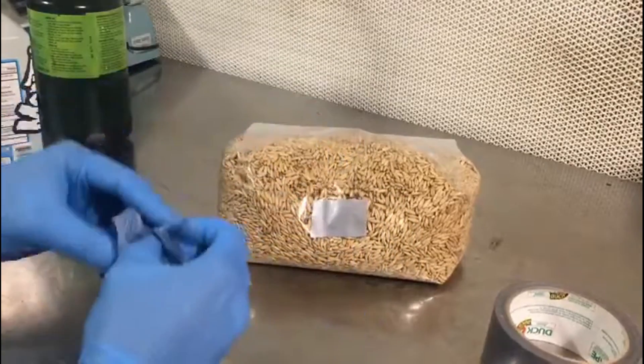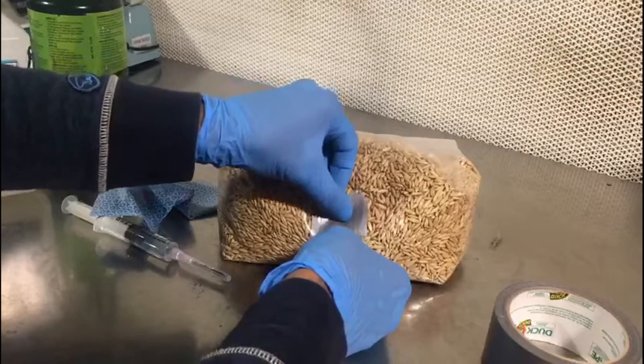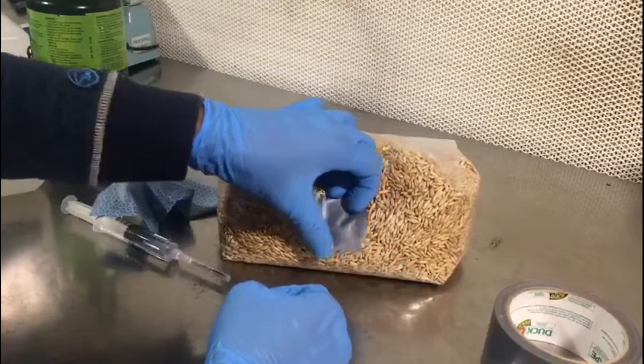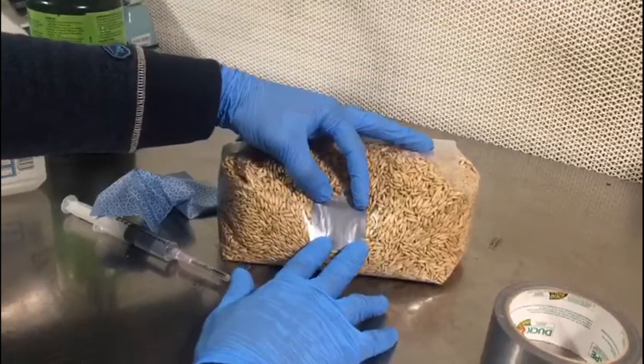Allow the alcohol to dissipate in between layers to ensure that our adhesive is sticking. You are going to want to do this inside of your still air box or in front of a flow hood, if that is accessible to you.